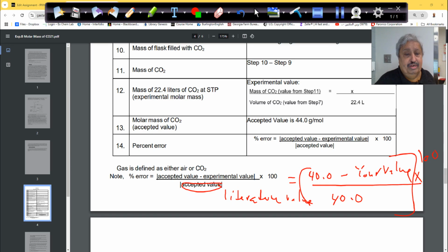It's a straightforward experiment, but it has a lot of sources of error everywhere. Weighing, drying, correct, waiting time, and that's the reason you have to use more than one purging of CO2. 20 minutes first, and then 10 minutes, and if the weighing is not consistent, add another 10 minutes, and so on. Okay guys, so that's about it, and let's start.